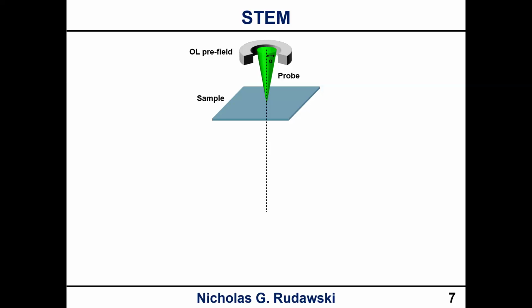So it's usually very obvious when you hit that sweet spot with the focus and you have the sharpest contrast. But again, depending on what I have with the sample, if I have a damage layer on the surface, if I don't have a damage layer, I might actually be focused not quite on the actual top surface. I might actually be focused a little bit differently. So yeah, it's a bit of a complicated answer, but definitely a good point to bring up.